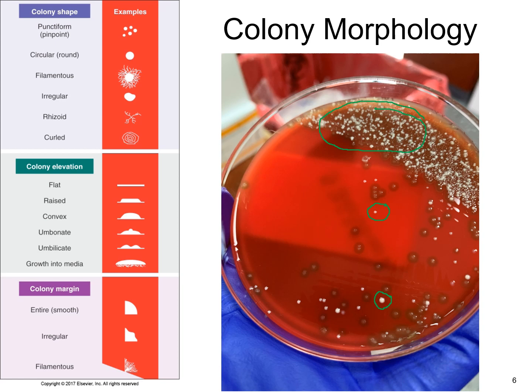You have some that are transparent. With this one here, it is 2 colonies that are side by side, but they have also done a partial lysis of the blood that's in the agar. And so that would be an alpha hemolytic organism there, and since it has had a partial lysis, you can see sort of a green tint halo around it.